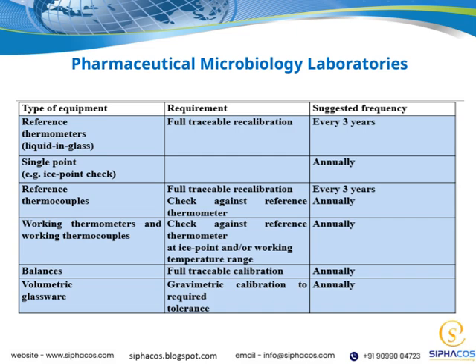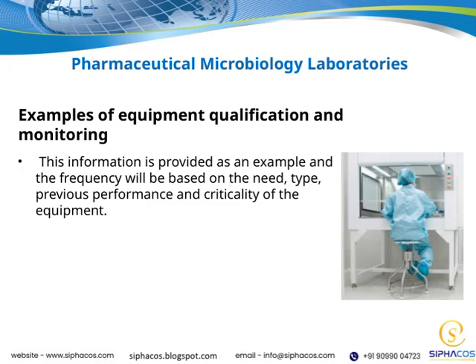Connecting this to our overall theme, maintaining rigorous microbiological control is essential for patient safety and product efficacy. It's not just about compliance, it's about protecting health and ensuring trust in our medicines. Let's take a look at some examples of equipment qualification and monitoring. Keep in mind, the specific details I'm sharing are just examples.